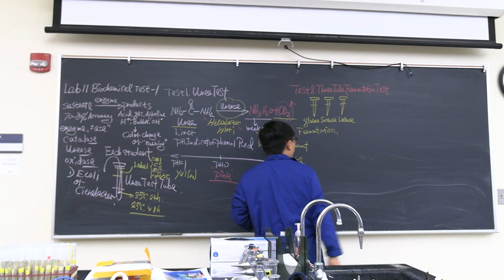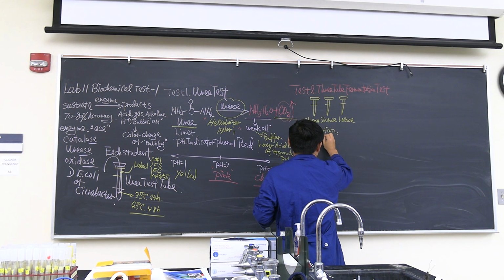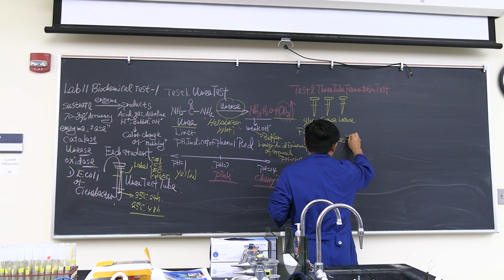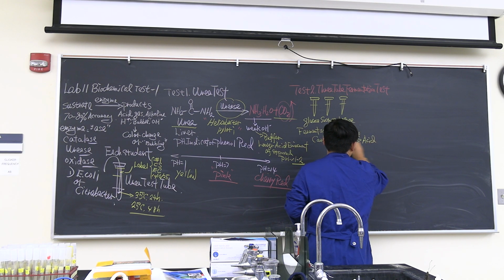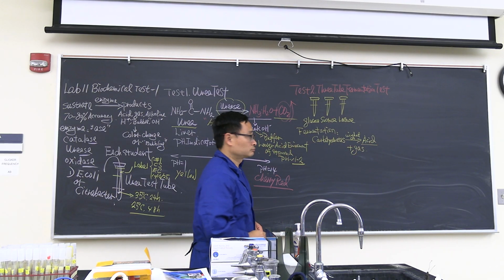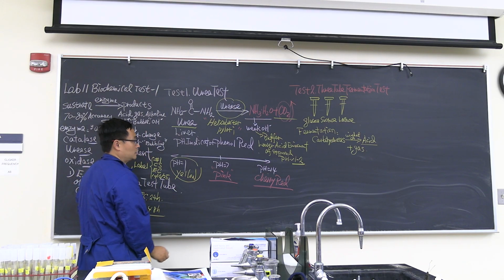If we want to say fermentation, very simple. It is like carbohydrates, usually without oxygen, they will generate acid and gas. Okay, how do we know the acid is generated? The same thing, it turns yellow.